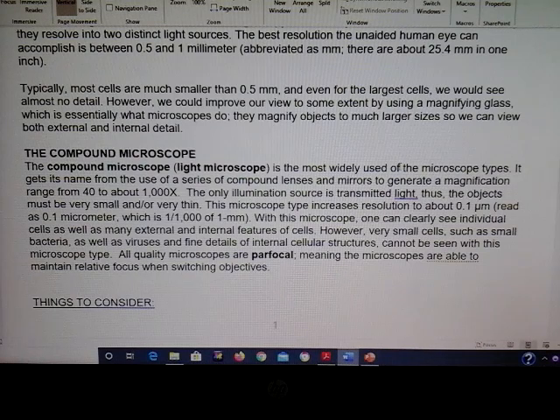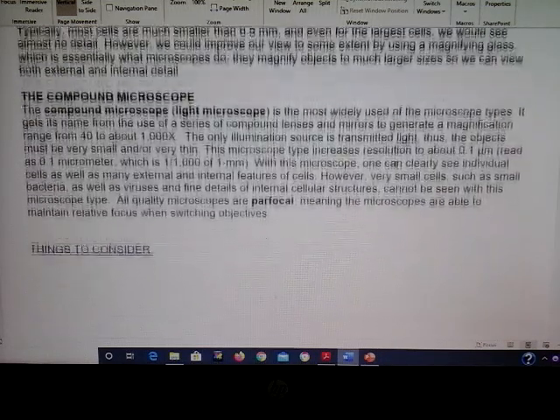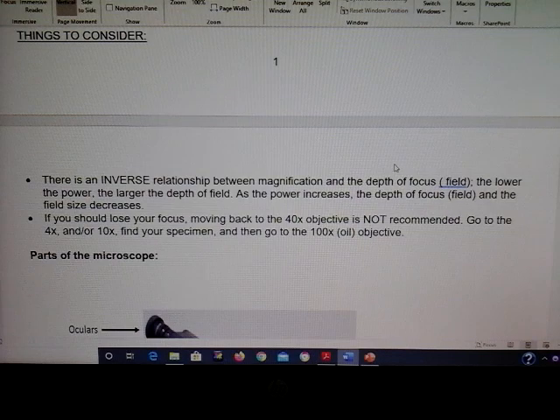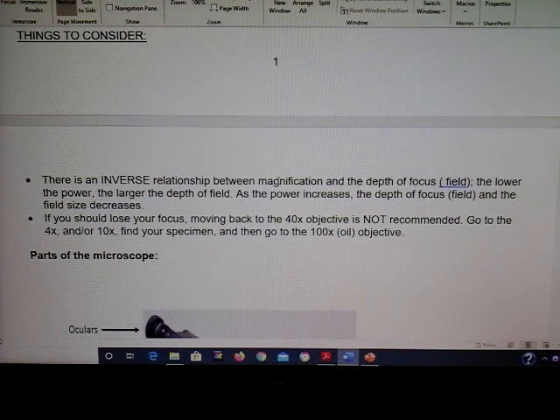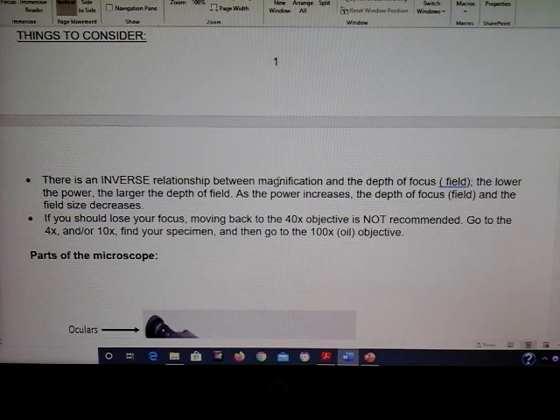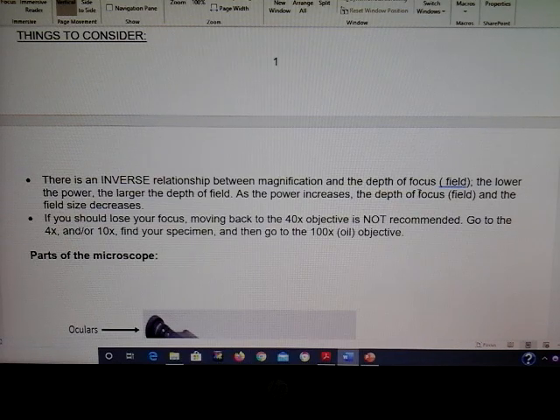We have what's considered a compound microscope, meaning more than one lens system. Keep in mind there's an inverse relationship between magnification and the field of focus — the lower the power, the larger the field. As you increase power and zoom in, the field gets smaller.